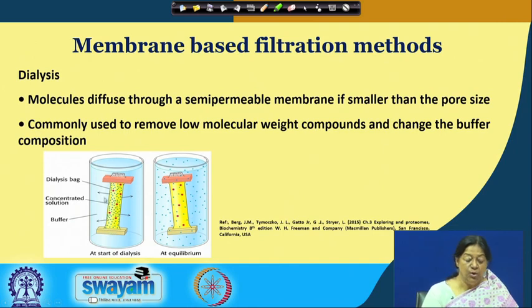In this case, we have a dialysis bag that has a molecular weight cutoff. Say if your protein has a molecular weight of 50 kilodalton, then you can use a cutoff of anything less than 50 kilodalton. So, the salt is going to move out and the protein of your interest is going to remain in the dialysis bag.